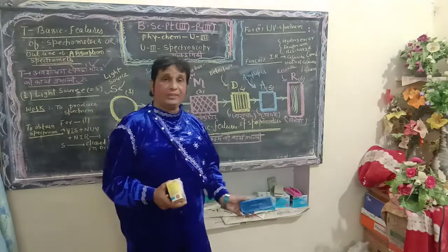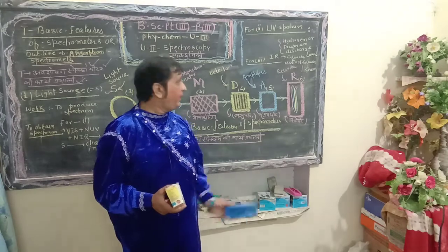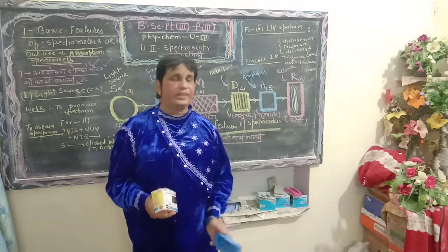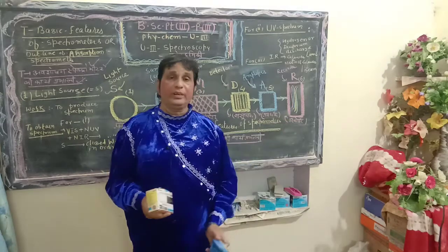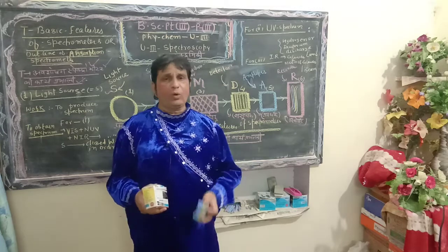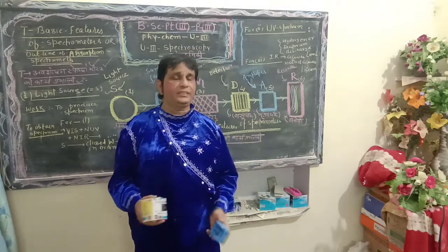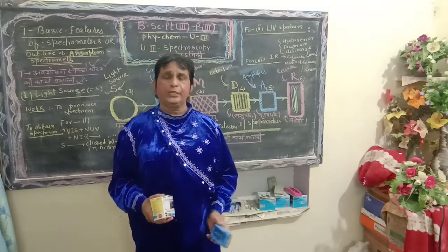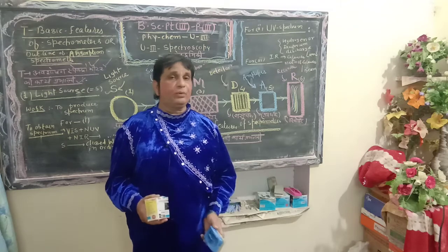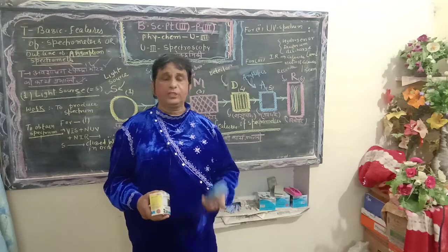Fourth is further connected with device 5. Device 5 is known as the amplifier, and the amplifier is further connected with the recorder. Hence, by the connection back to back of 6 devices to produce a very large device, such a large device is known as a spectrometer. Let us try to understand one by one the important parts, work and functions of these various small devices.